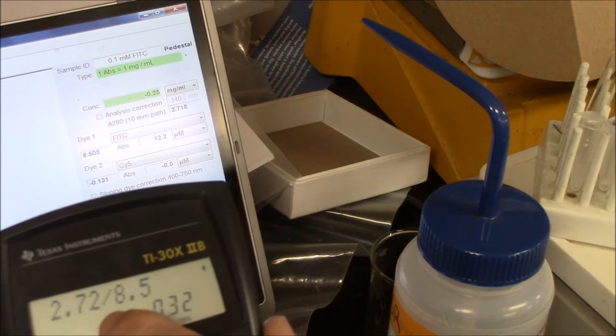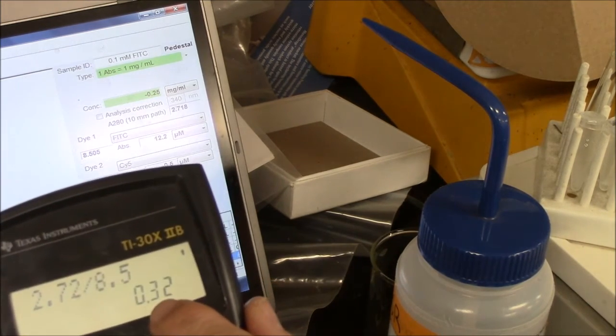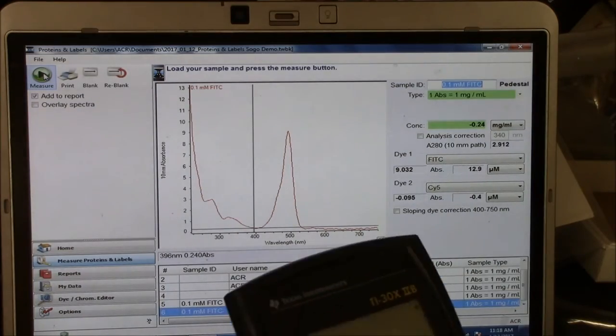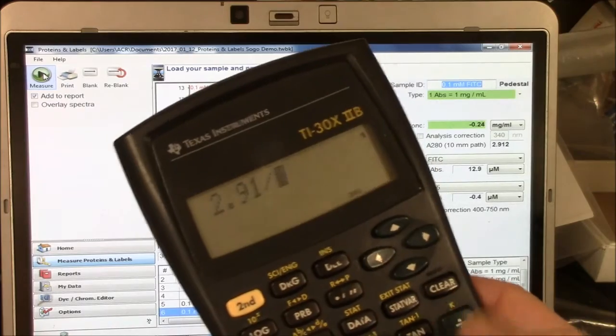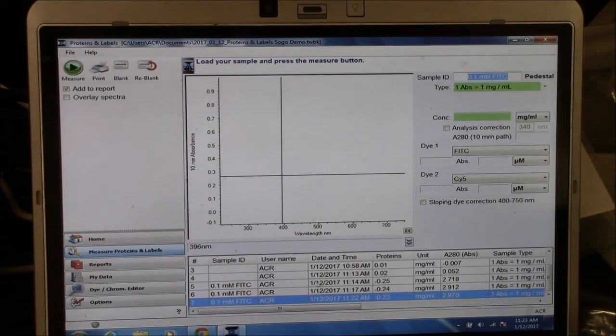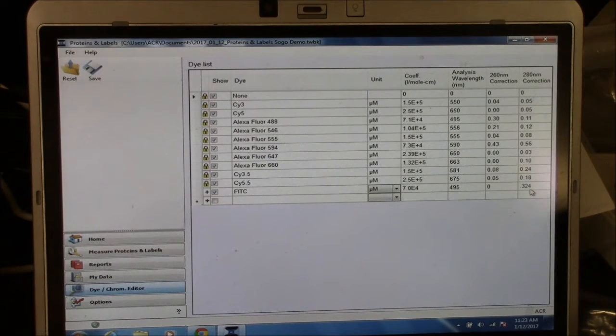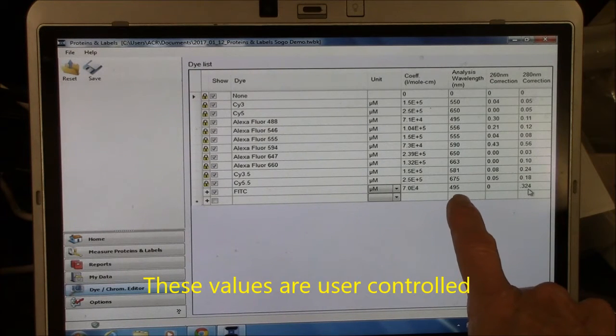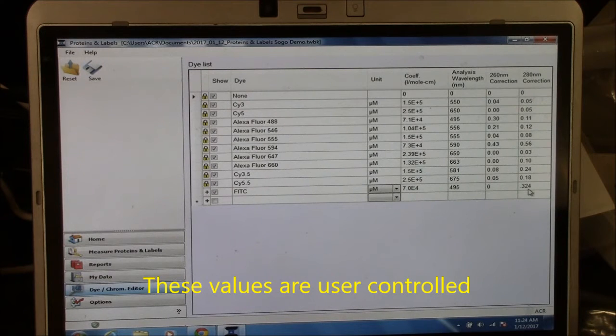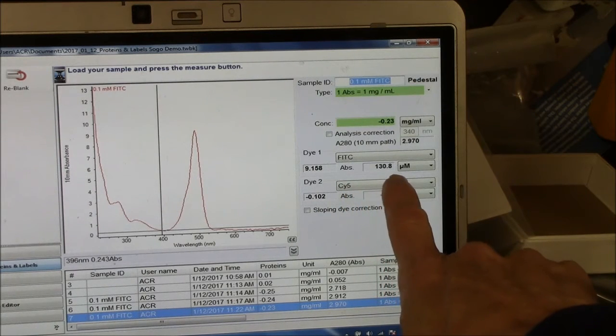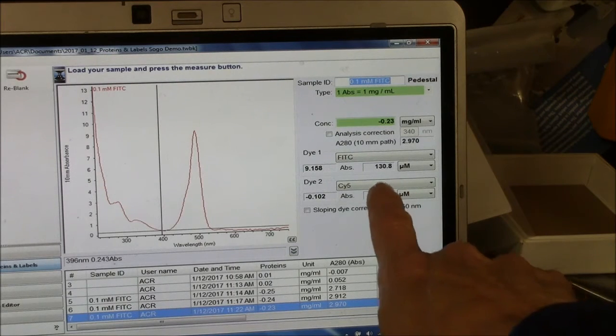Here in my calculator, I've taken the absorbance at 495 nanometers and I got a ratio of 0.32. I repeated it and I got similar values, slightly higher, but similar. The ratio here, 2.91 divided by 9.03 gives me a similar ratio, 0.32. So that ratio that I found of 0.32, I put that into this data table here, saying this is the absorbance at 280 nanometers as a ratio of the absorbance at 495. This is the extinction coefficient for FITC, 70,000. The machine is saying that given the extinction coefficient of 70,000 per molar, that the actual concentration here is 131 micromolar.